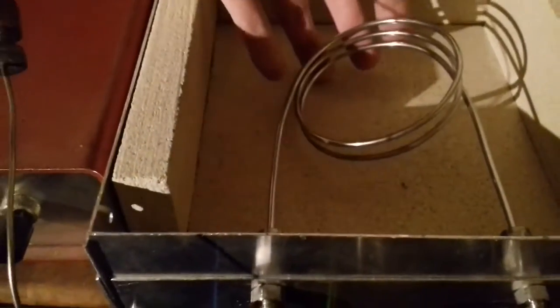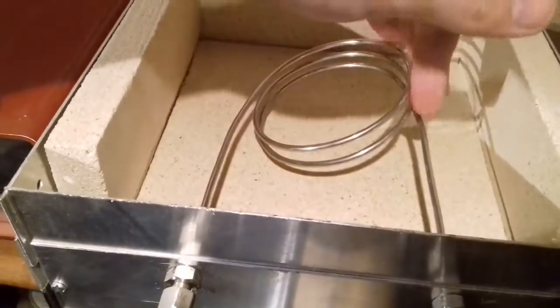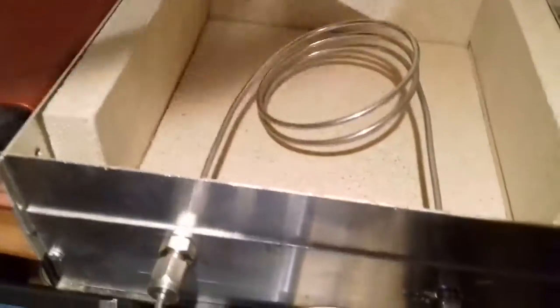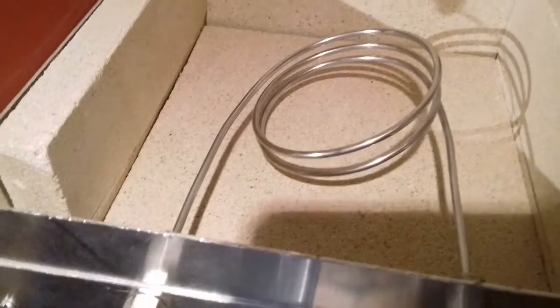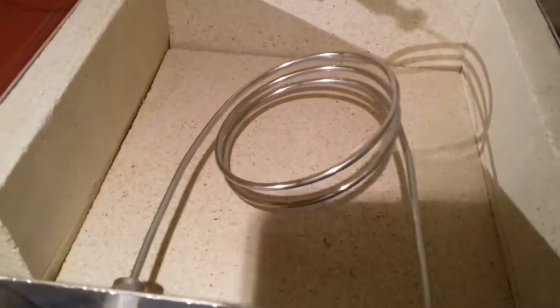This is the column. This is what does the actual separation. And it's packed with crushed bentonite clay from cat litter, 80 to 100 mesh.